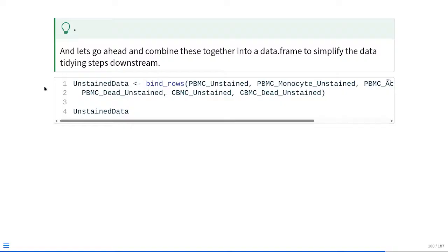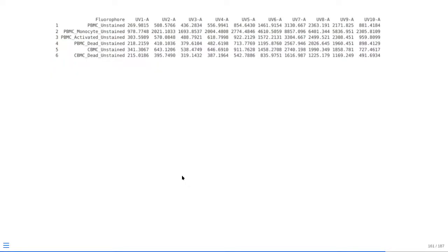And make sure we're not jinxing ourselves in terms of the internet. If we go to the next slide, we can see at this point we got the corresponding numeric values that we're expecting to see. And we also have, under the fluorophore column name, the individual names that we're expecting to see for the negative background subtraction. And double checking here. There we go.